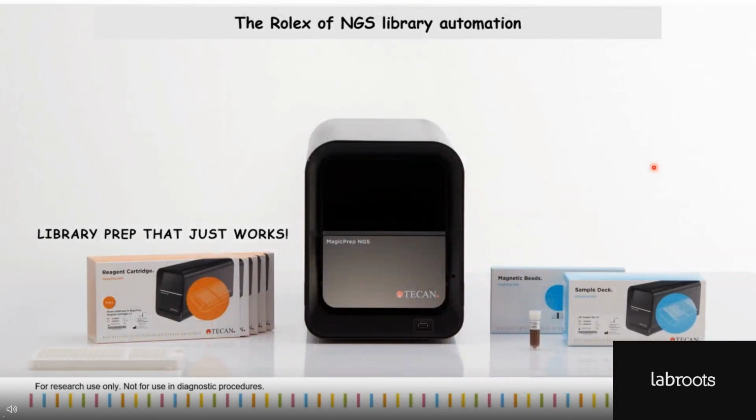And then we went back and were trying to make a lot of libraries, and the opportunity presented itself with the TECAN. This is the beautiful TECAN machine, which looks essentially like an extended PCR machine, where you add your RNA sample and magically something happens and it generates consistent libraries without any hiccups.